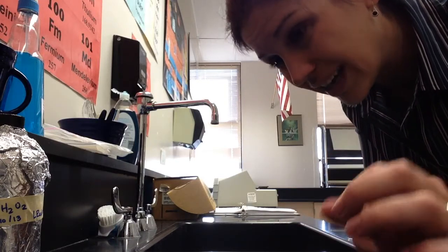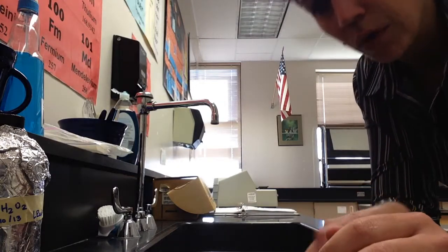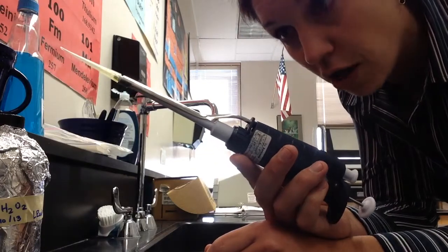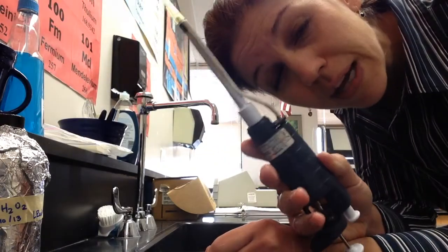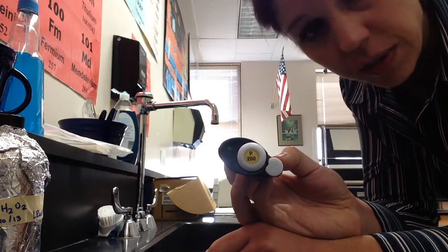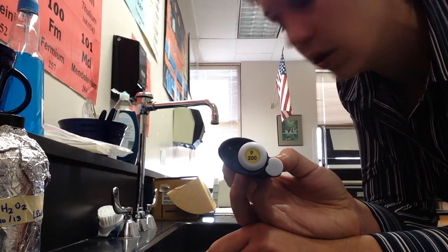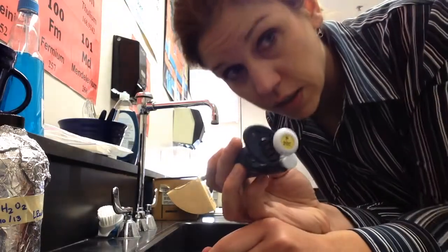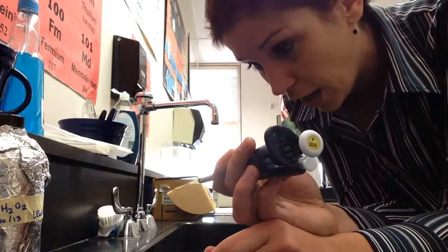To measure out these tiny volumes precisely, we use something called a micropipettor. Depending on whether or not you took honors bio and who you had, you may have a lot of experience with this particular tool. This one is actually called a P200. The one you used in bio was called a P20 because it measured out even smaller amounts. And we'll use that one when we get to the DNA lab in Unit 5.